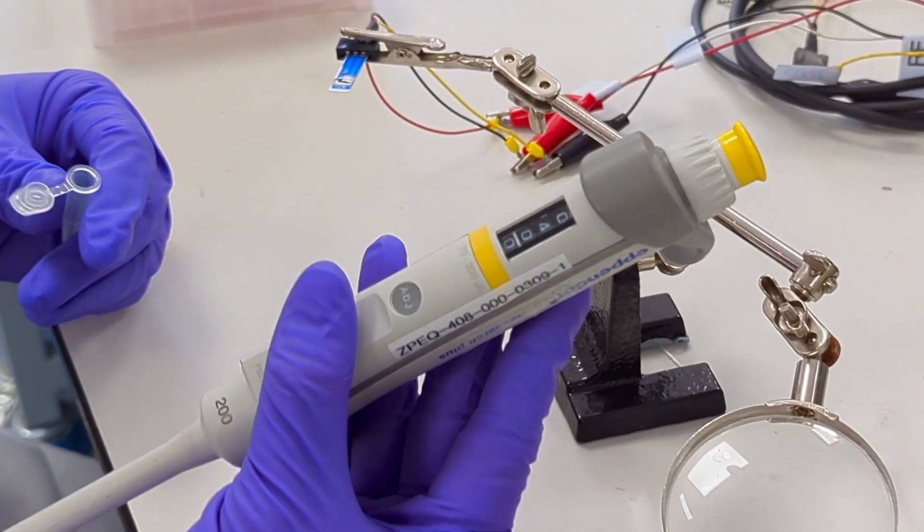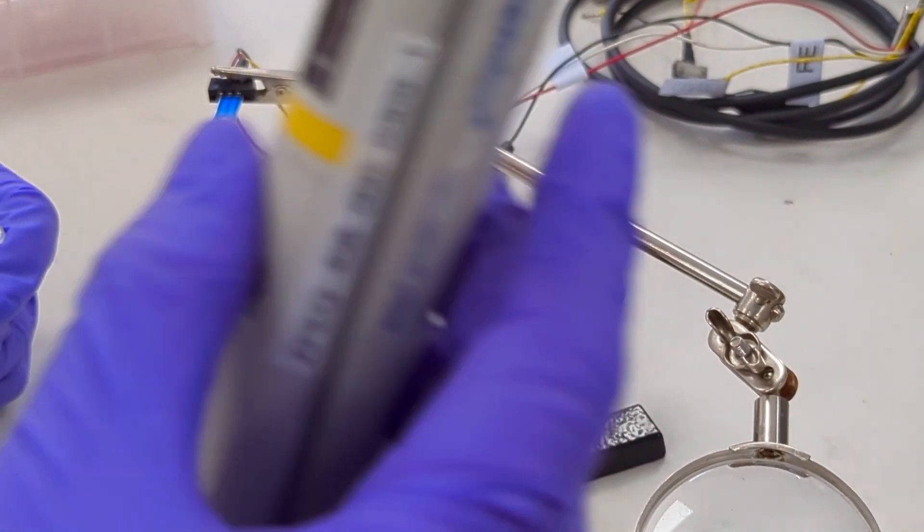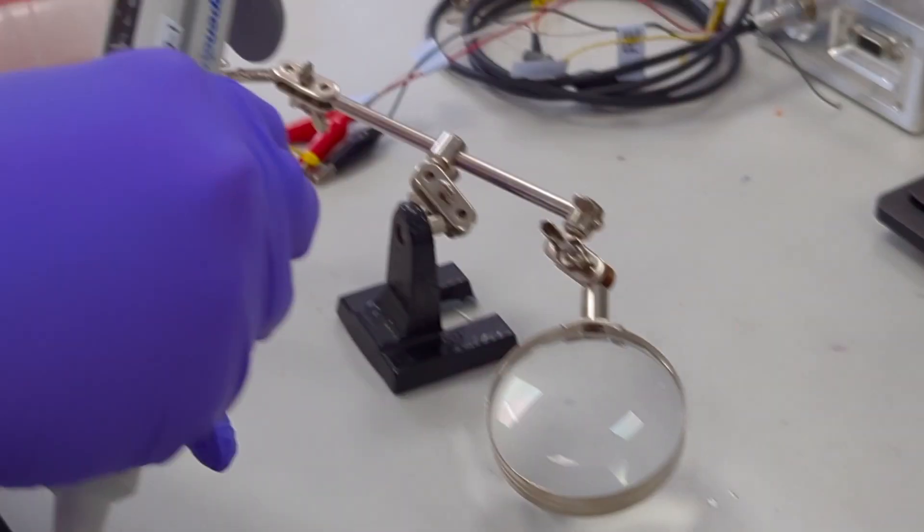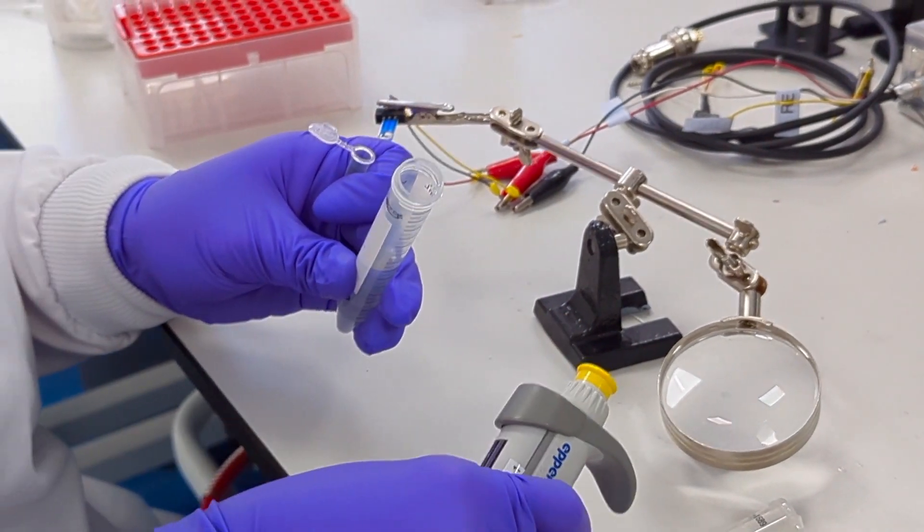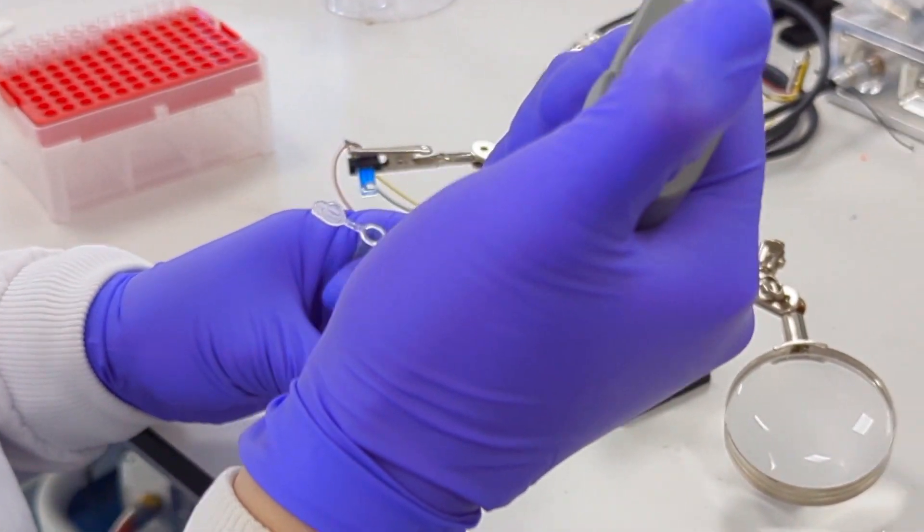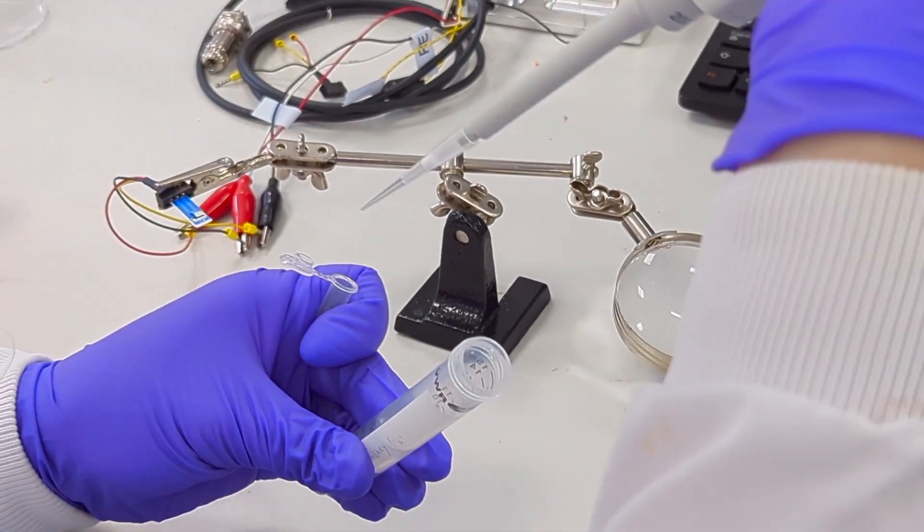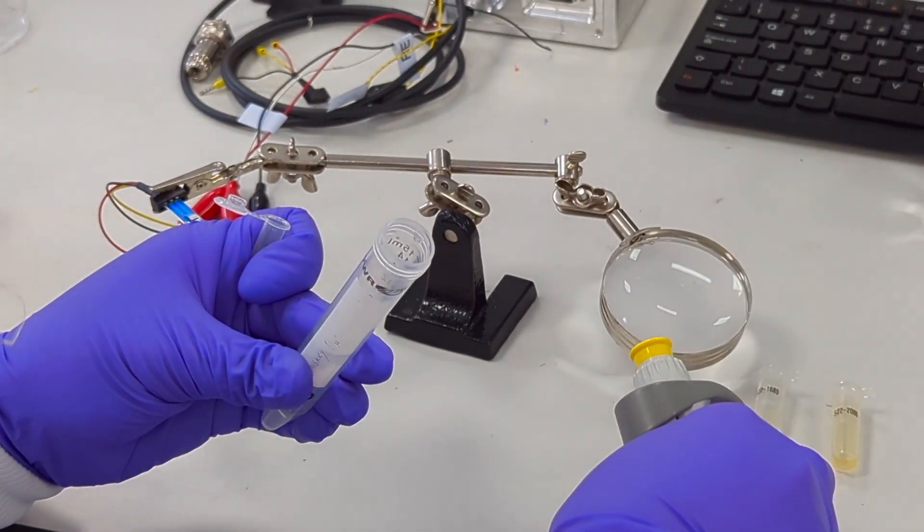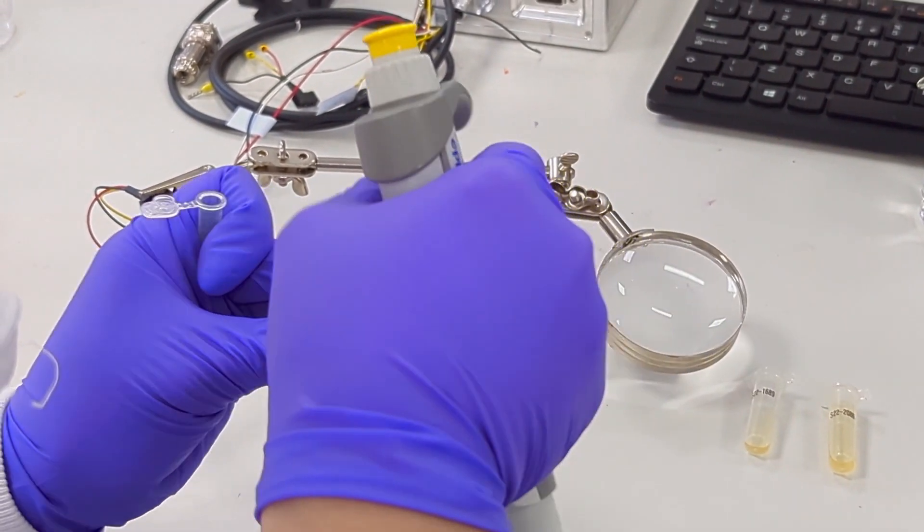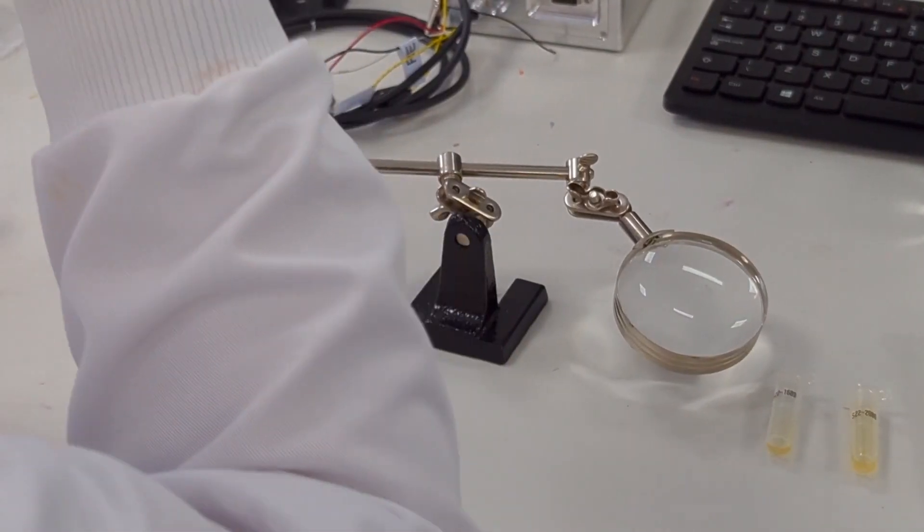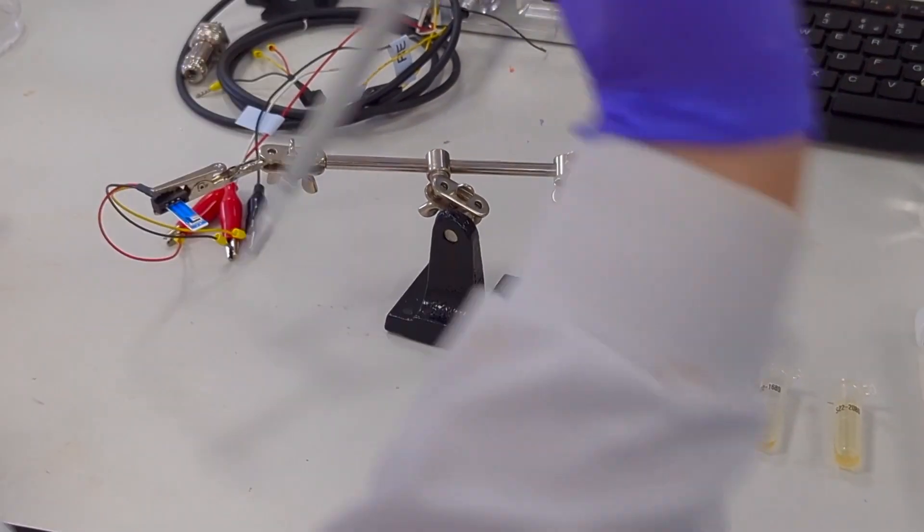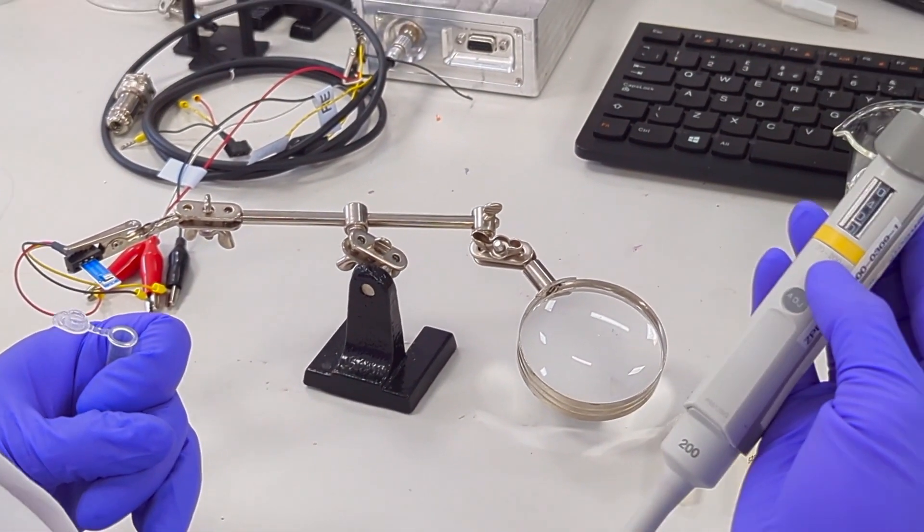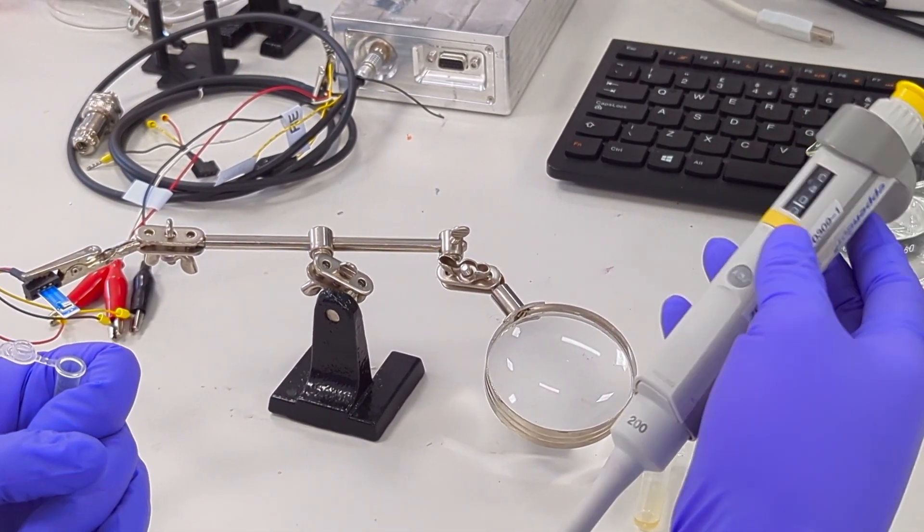We prepare a second sample with the similar procedure we followed last time. We prepare 40 microliters of the whiskey buffer solution into a small falcon tube, followed by 40 microliters of the second whiskey sample.